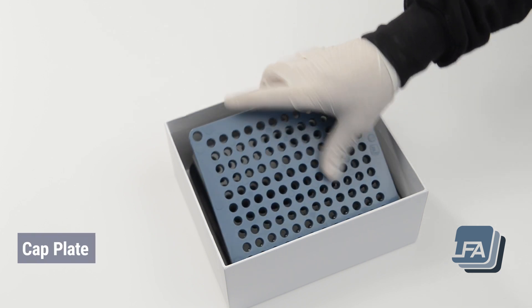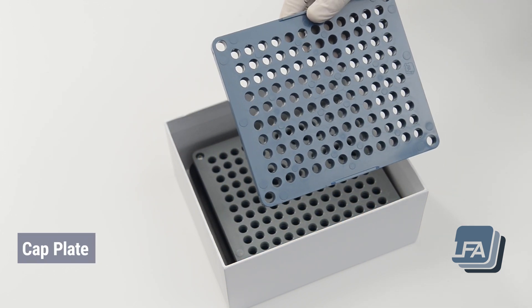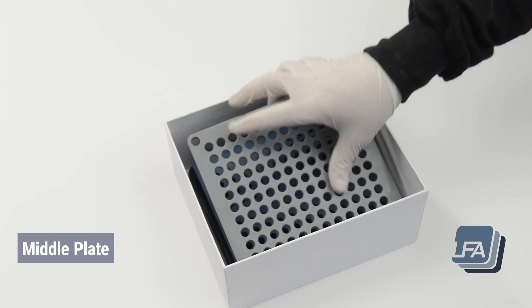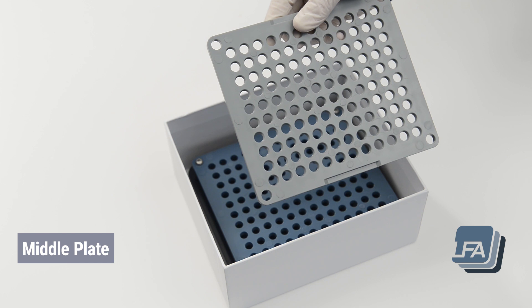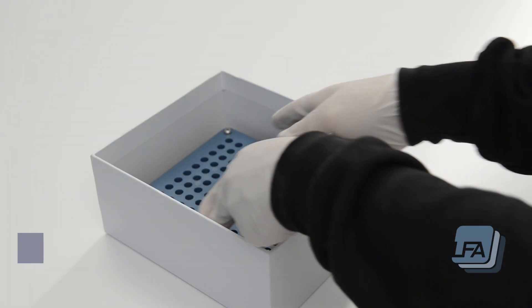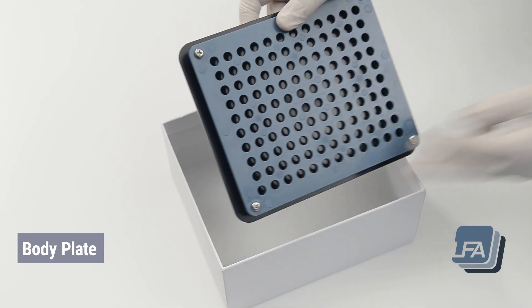The cap plate, used to hold the caps. The middle plate, used to cover the cap plate so the cap plate can be flipped over. The body plate, used to hold the bodies of your capsules.